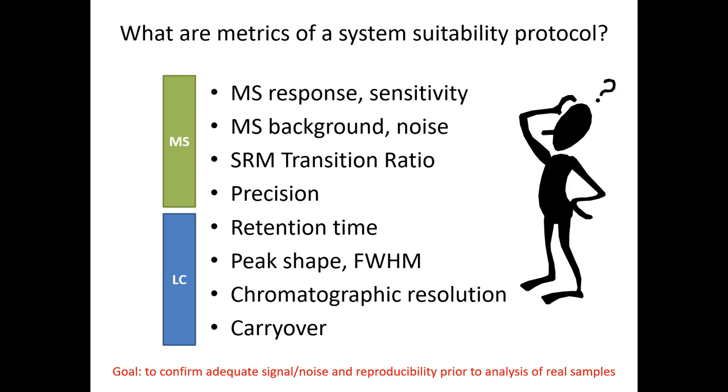And so I ran an MS1 scan, which does not require the collision gas, and all of my peaks were there. And so I was like, oh, shoot. I went over and I looked at the tank, and it's helium. This is after I started making a fuss, and I contacted the engineer, and they did their tests online remotely, and they're like, something's wrong with your collision gas. And I'm like, yep, nope, it's fine, I got it taken care of, we're good now. And I admitted to my mess up.